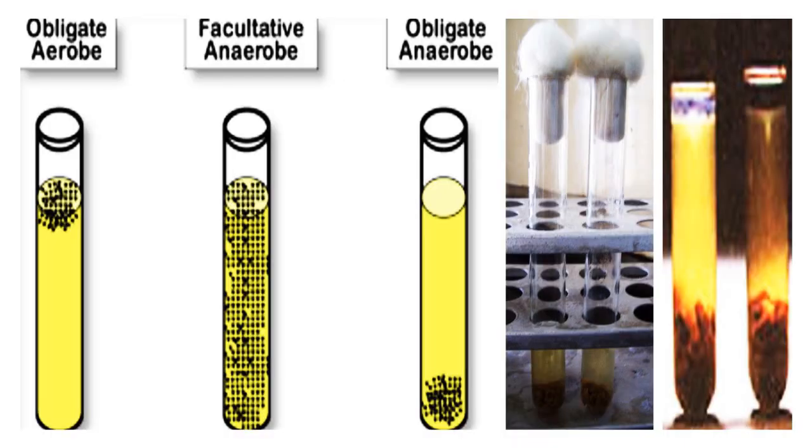And finally, this slide presents the outcomes of anaerobic cultivation methods, as we show the first test tube viewing obligate aerobe bacteria, while the second test tube displays facultative anaerobe bacteria, but the third demonstrates obligate anaerobe bacteria.